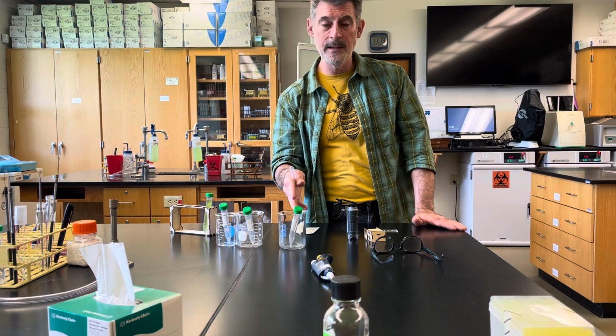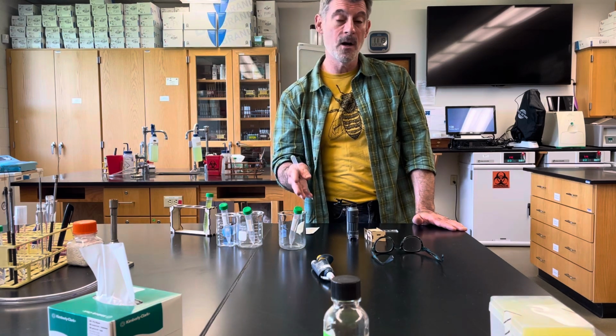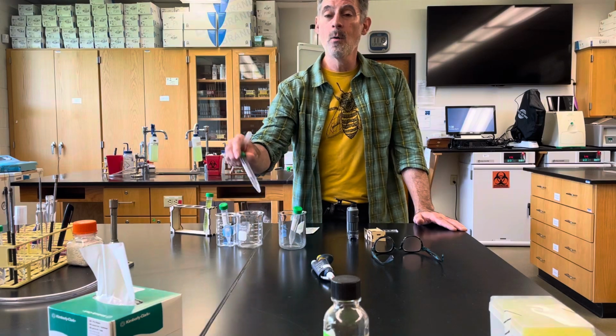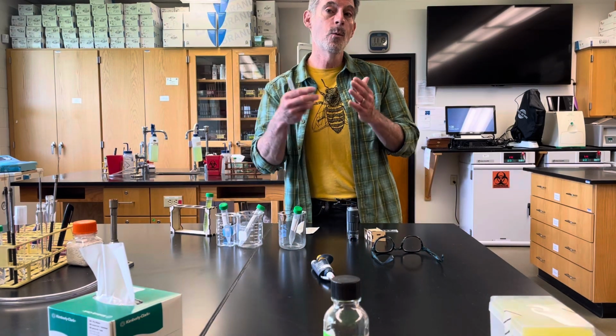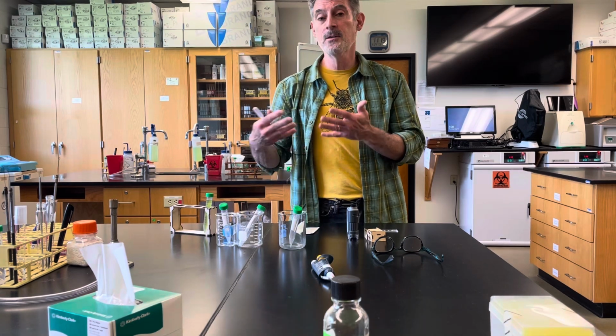One of them is going to be in light, 24 hours constant light. One of them is going to be in dark, 24 hours constant dark. And the other one, you're going to have to just put in a normal light-dark cycle. And the idea is you want to see over a period of time how the cell number changes.